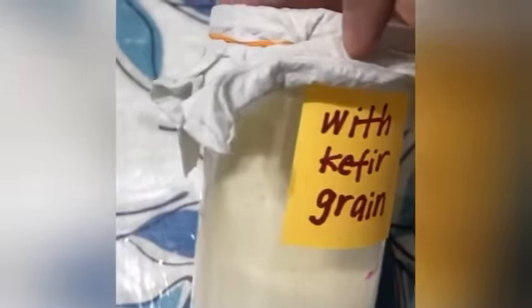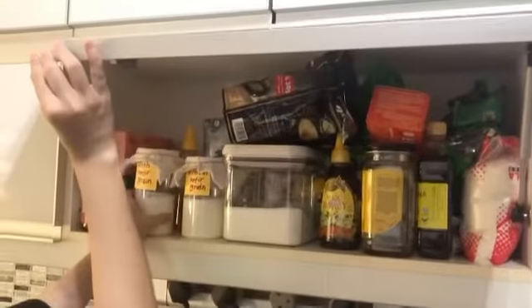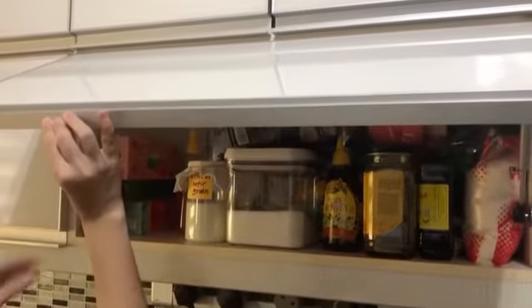This is the physical appearance of milk with and without kefir grains. And both milk smell like normal milk. We need to put it in a place with no direct sunlight and that is warm, which is inside a cupboard. Right off the bat, the first thing that I've noticed is the smell that comes out from the cupboard.